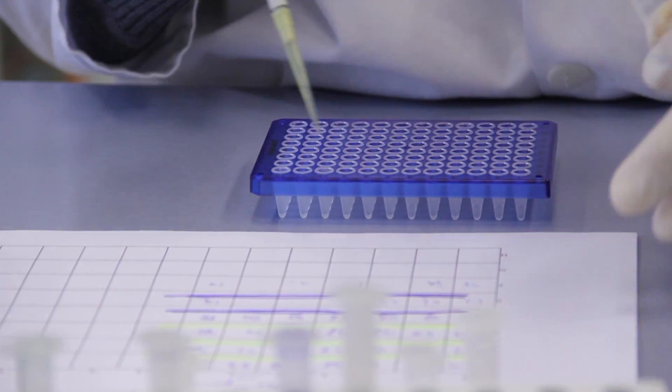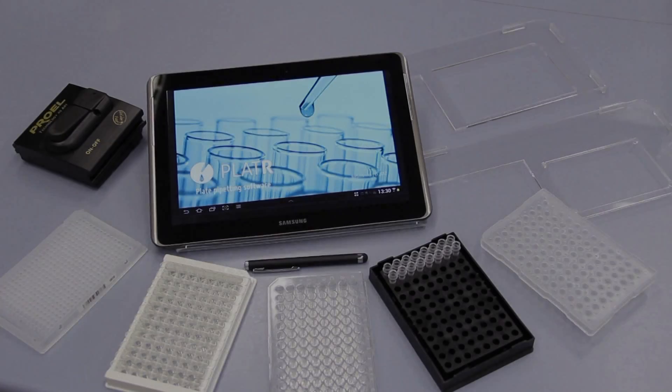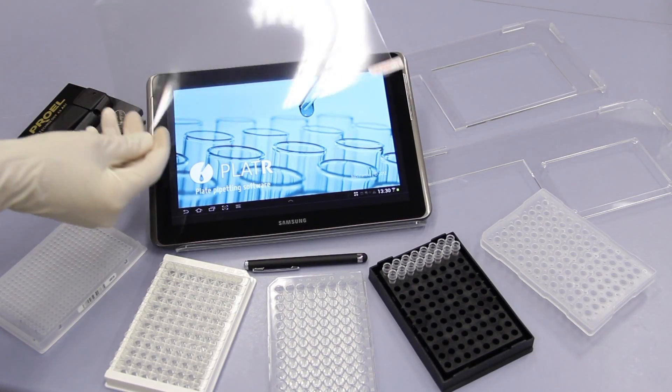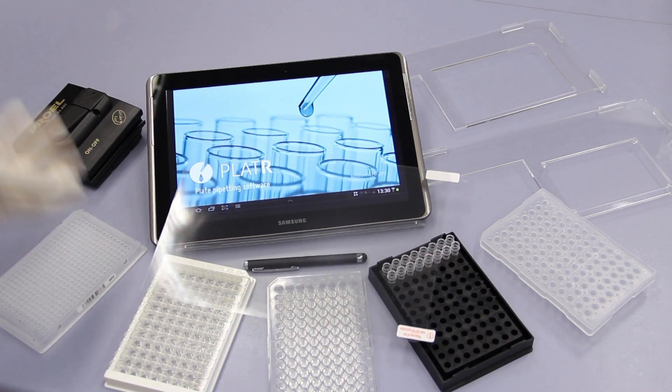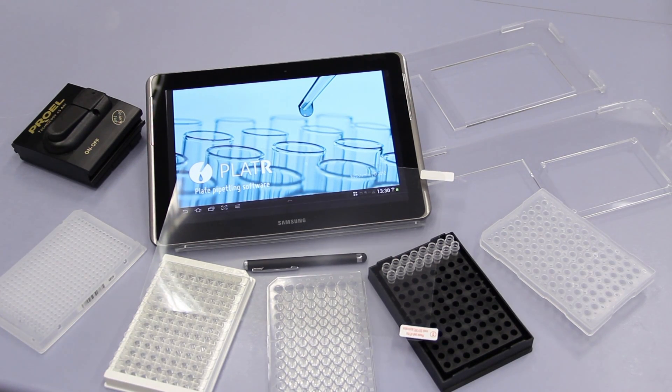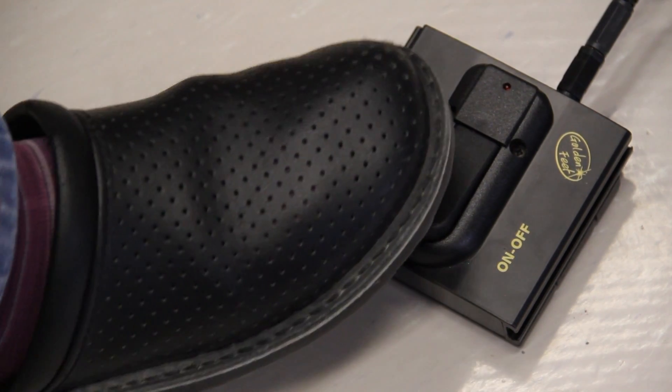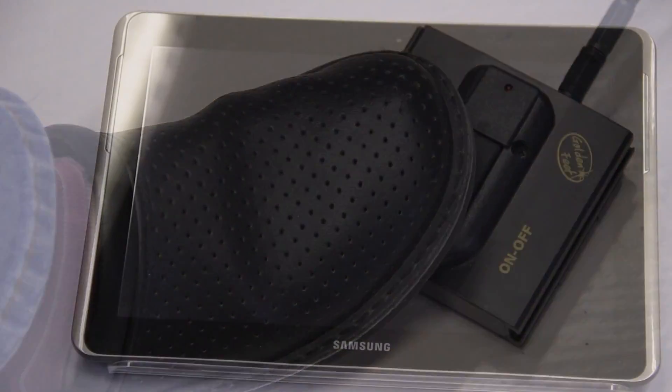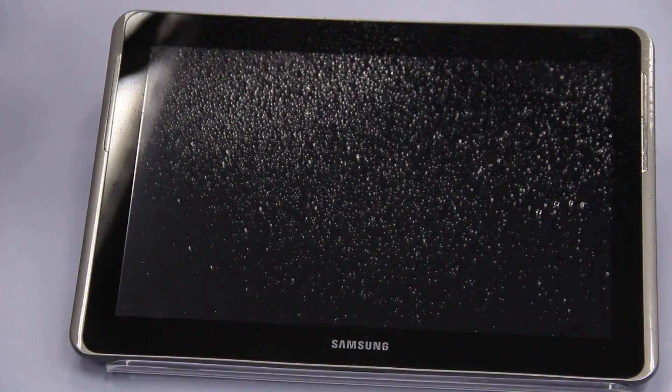You won't have to worry about whether you put samples into the wrong wells. This smart solution supports 384-well and 96-well plates and comes with customized plate holders, a foot switch, and a protective foil. Platter can also be easily cleaned with DNA remover.